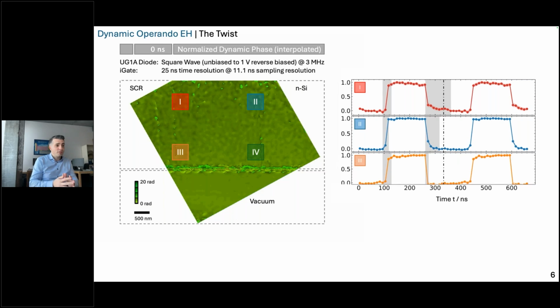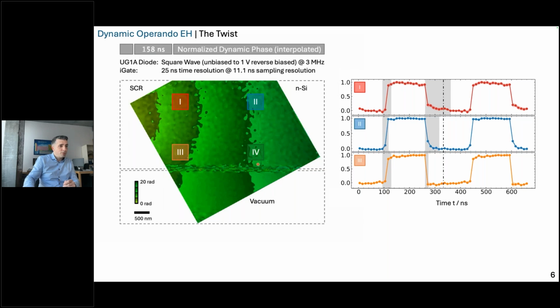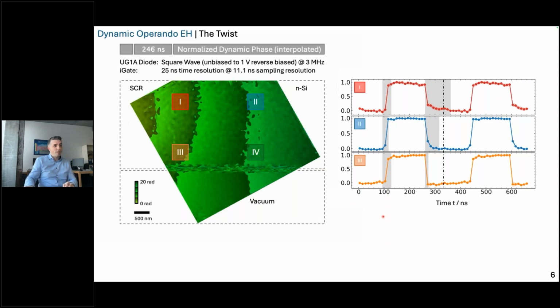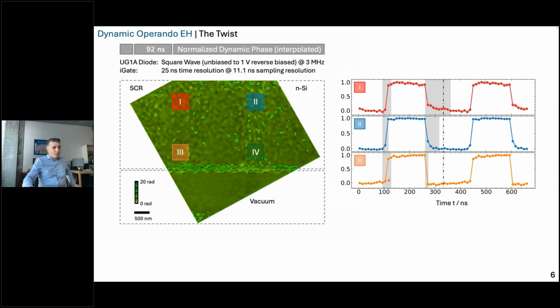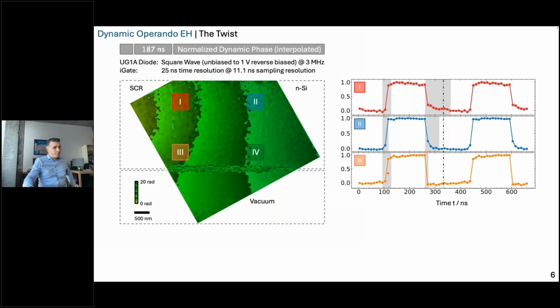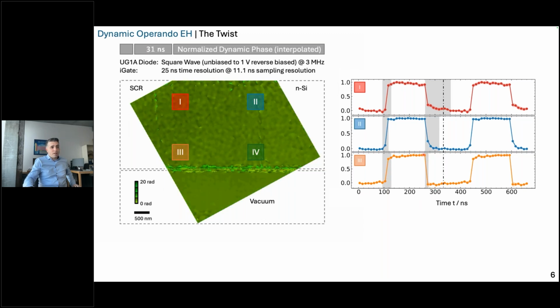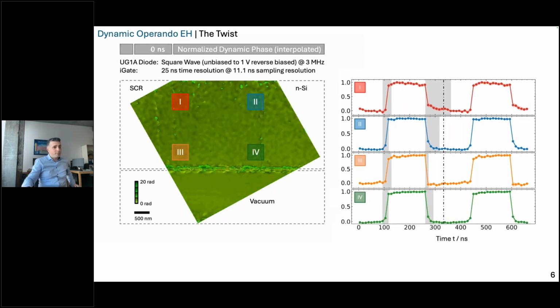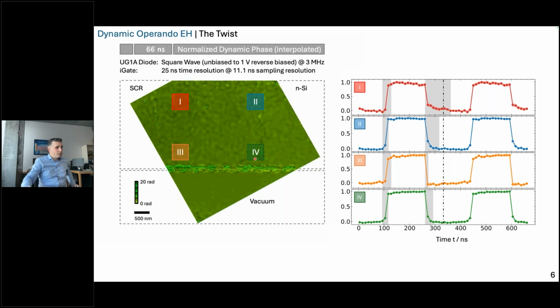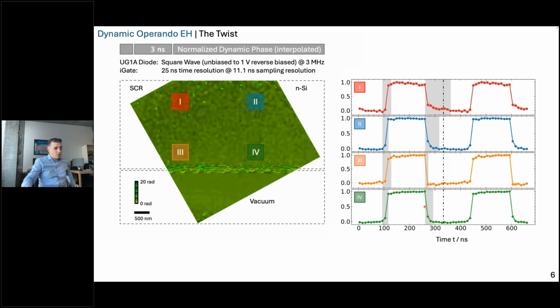So for the third region, which is very close to the edge, we see a completely different switching behavior. We actually see that switching into reverse bias condition stays nearly the same, but then again going back into unbiased condition happens a lot faster. And more or less the same is visible for the part here, where we are also close to the surface, but more on the N side of the silicon diode. So the times go shorter compared.